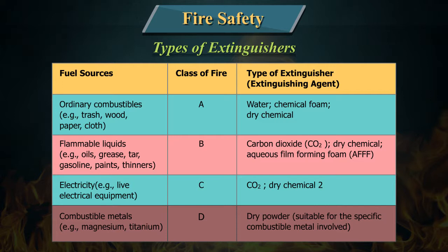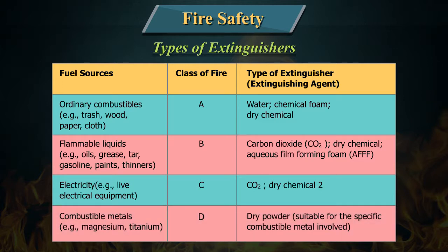Its class of fire is C. Types of extinguishers for Class C: CO2, dry chemical. Fuel source — combustible metals, example: magnesium and titanium. The class of fire is D. Type of extinguisher: dry powder suitable for the specific combustible metal involved.